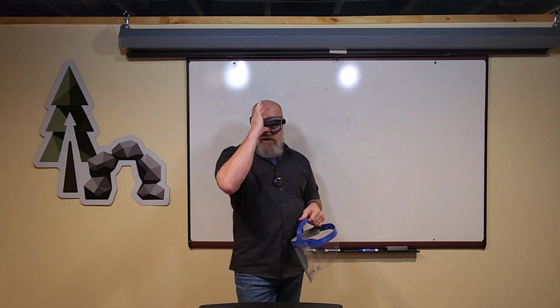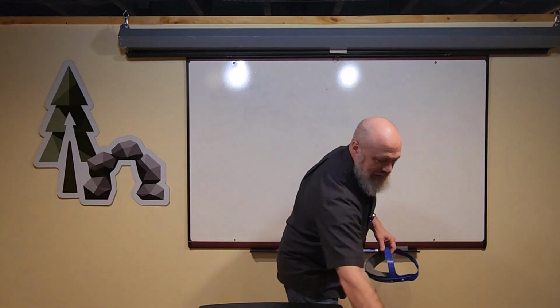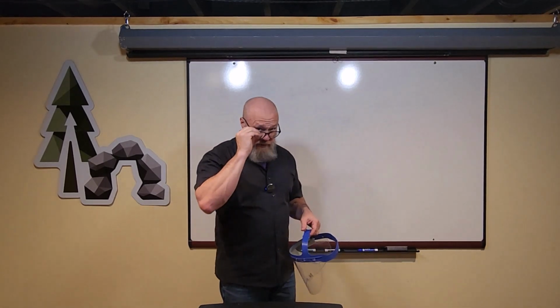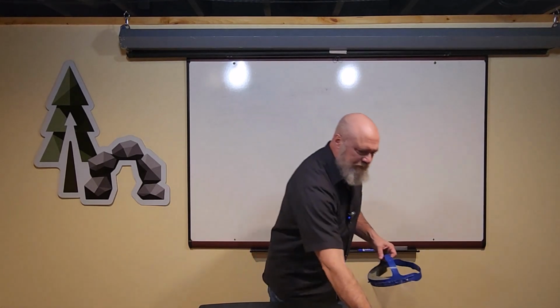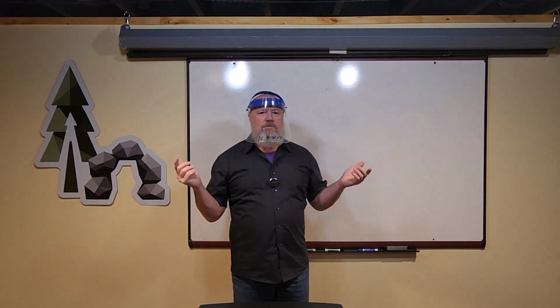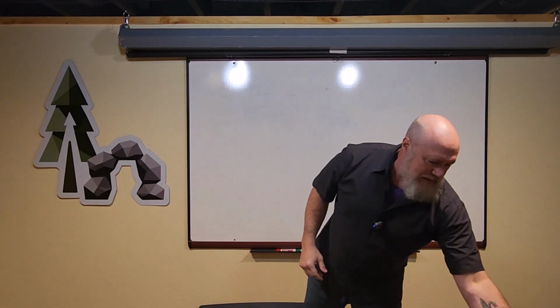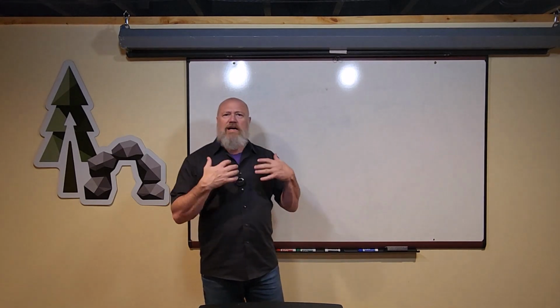A pair of goggles protects things from splashing up in your eyes, unless you wear eyeglasses, or when I dissect, I almost always have my reading glasses on so I can see up close. Sometimes you can go full safety and just put on your face shield. That way you don't have to worry about anything getting on you. So gloves, coat, closed-toed shoes, and then goggles or face shield or eyeglasses. While the glasses are not strictly necessary, they're also a good idea.